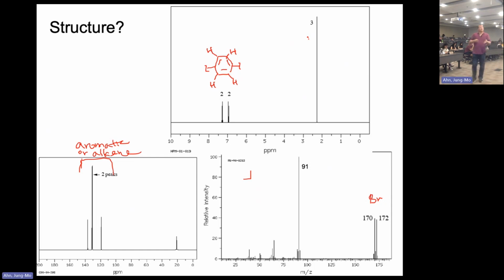All right. So we have 6 carbons and 4 hydrogens, we found out, right? And that's also shown by the carbon NMR. We got 4 peaks in the aromatic region. So that makes sense. We got a symmetry there. So these carbons are the same as those, these carbons the same as those. So we only got 4 different carbons in the benzene. So the 4 lines of the aromatic carbons totally make sense along with that.